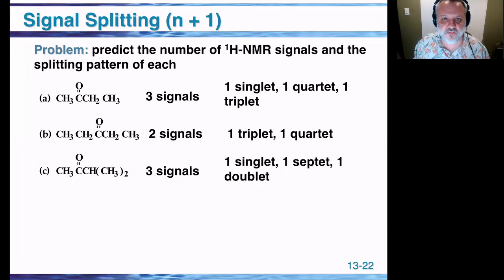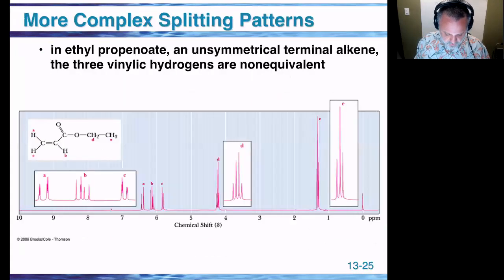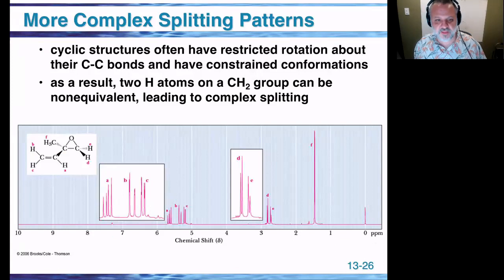All right, there's all the answers. And the first 2 certainly match up to what we have. The third one matched up to what we had, or the first and third. Did the second one match up to what you predicted? I hope so. Okay, there's one other thing that I need to get at. I need to get at this idea about complex splitting patterns.